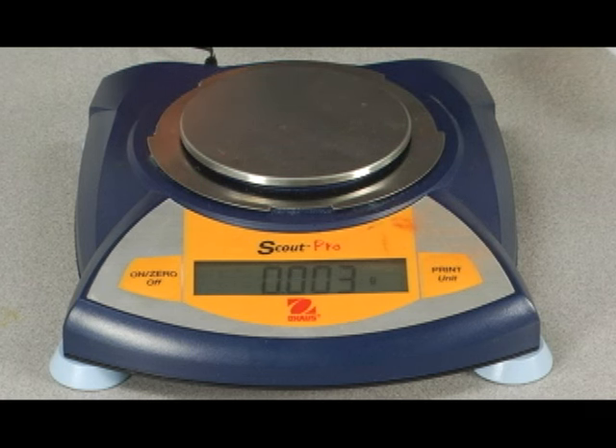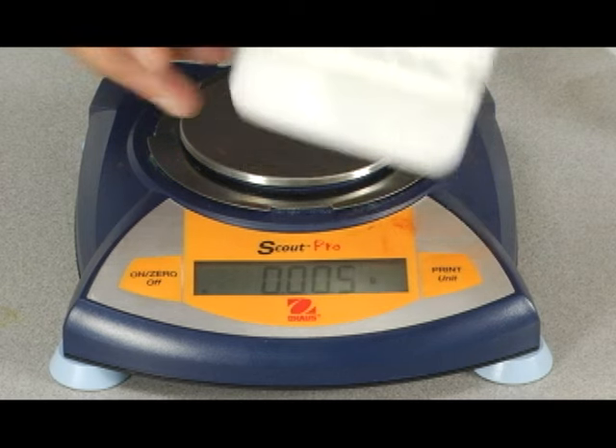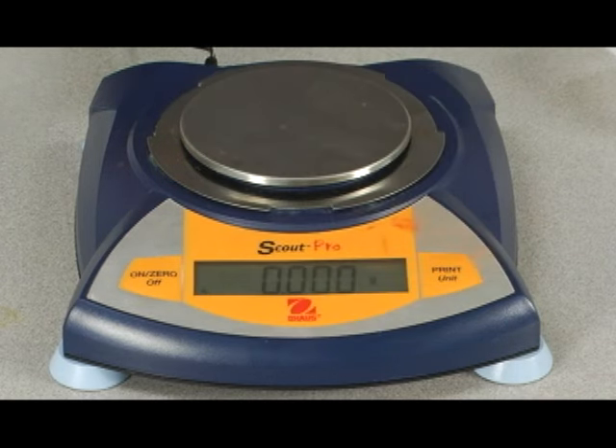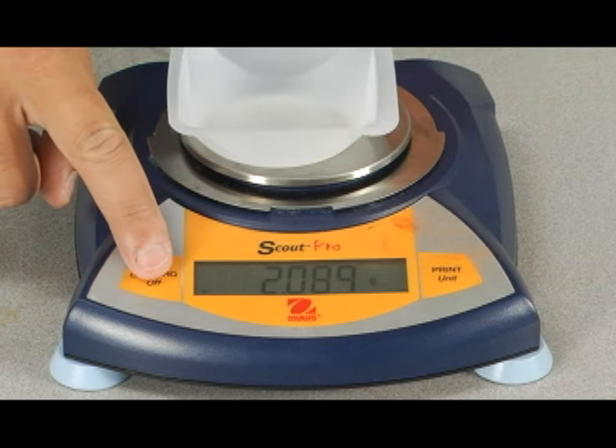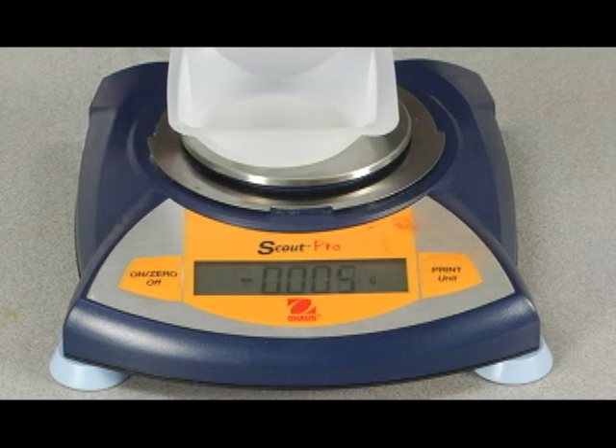If we were to mass out, say, 0.75 grams of sodium acetate, we would first want to place the boat on the scale, hit the zero, which is a tare feature. That way, we don't have to remember how much the boat weighs.